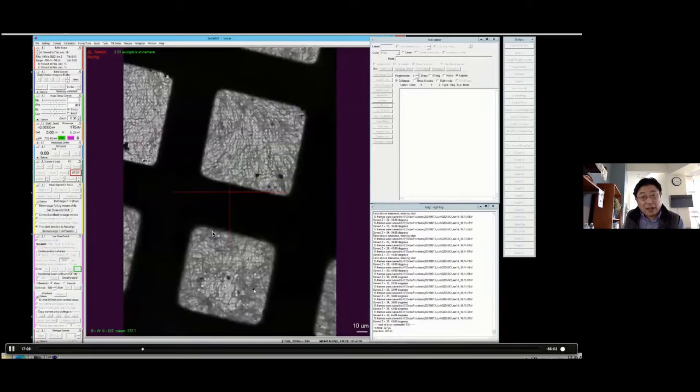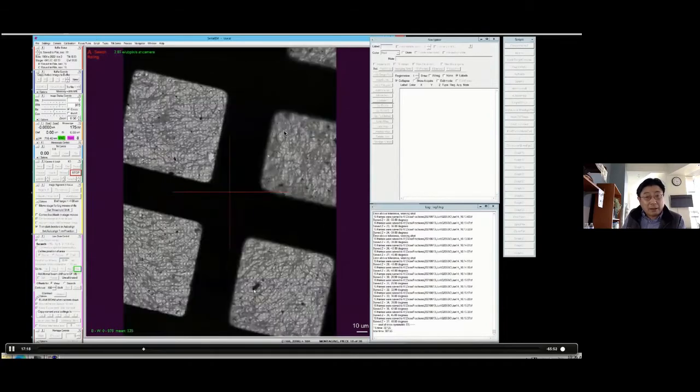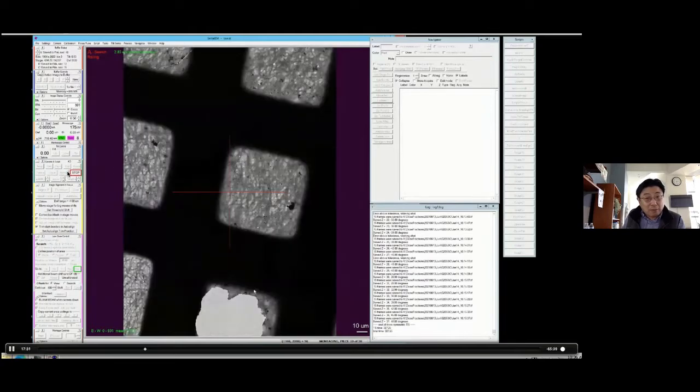If you use a very high mag, this montage will take forever. In our setting, we are very lucky to have sampling setups. So it's very nice at this low mag. We can literally use about 6 minutes to get a very good view of the whole grids. And then we can use this so-called search mode. That's typically about 2000X in the Titan setting.